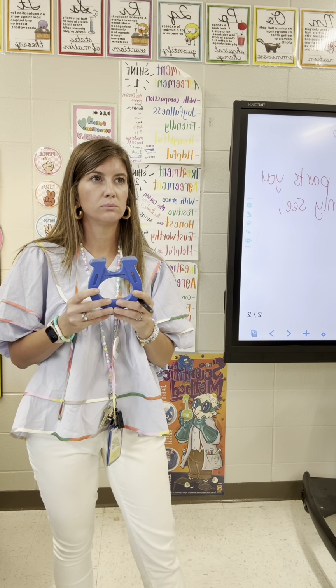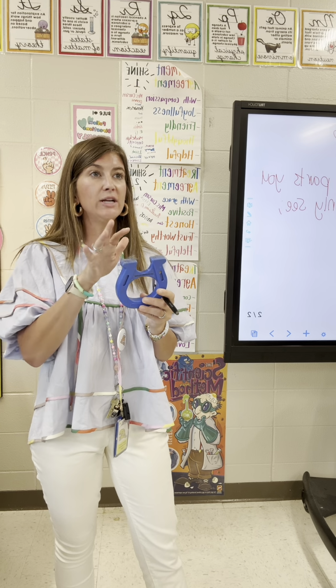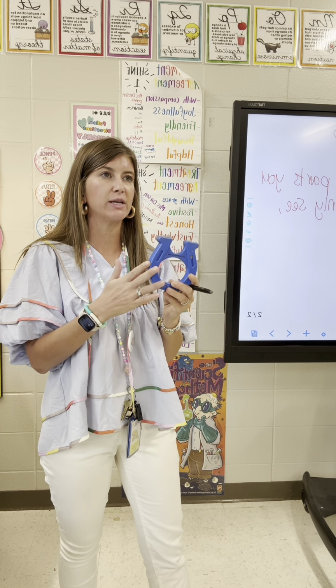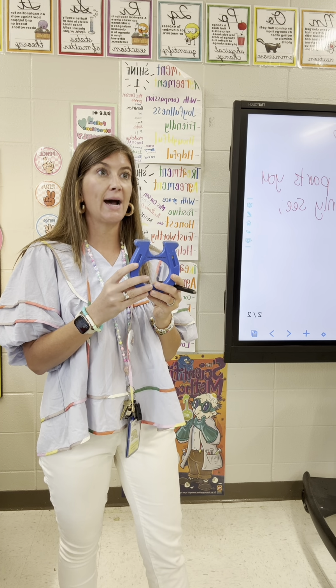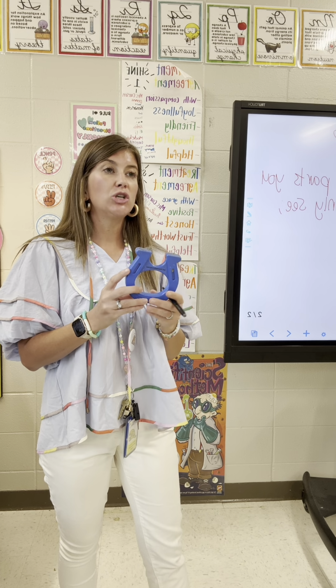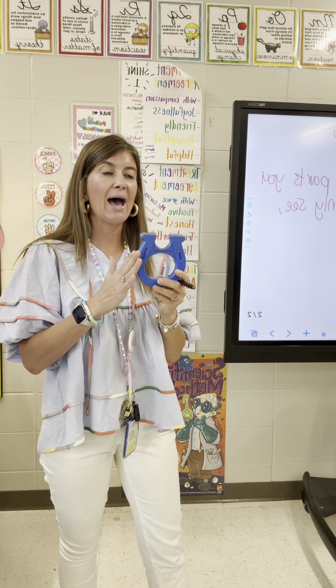It's attraction. Okay, so which substance in your mixture has magnetic properties? What is that? Metal. Iron. Iron filings. So your iron filings have a magnetic property.